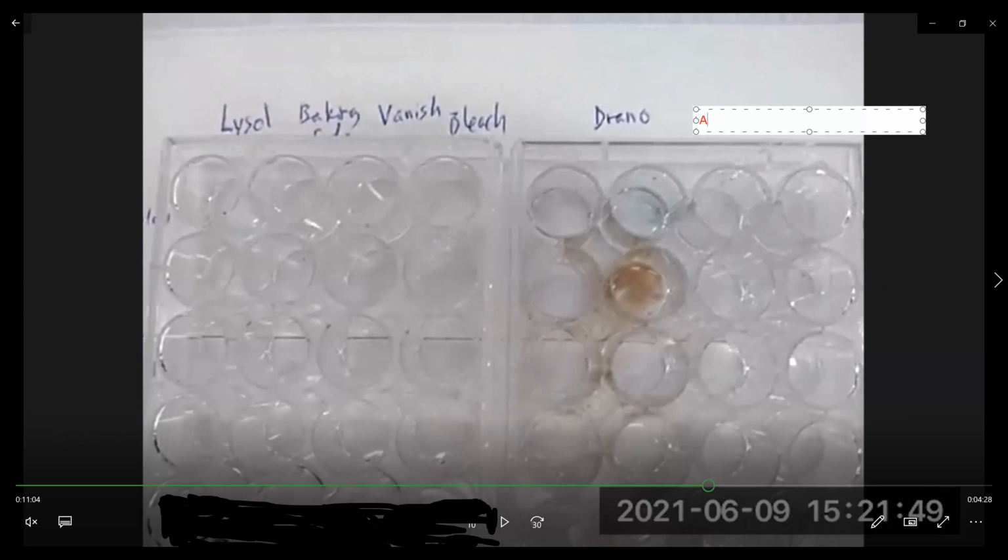So if we have silver nitrate and then we add it to sodium hydroxide, this is going to be a double displacement reaction.